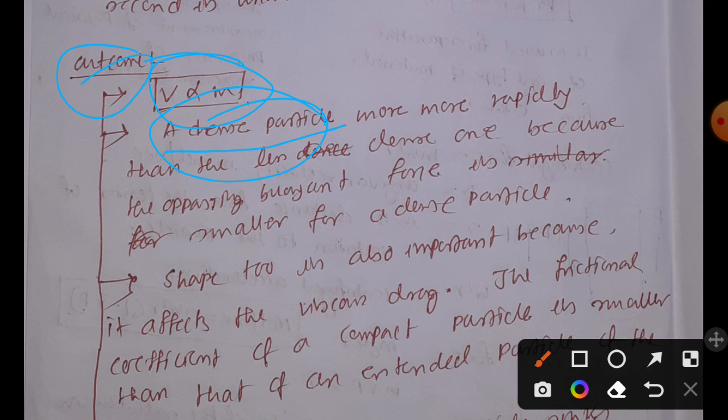What kind of important role? Remember that a denser particle will exhibit a lower buoyancy force than a less dense one. That means density is inversely proportional to the buoyancy in the case of the centrifugation principle, which you need to keep in mind.